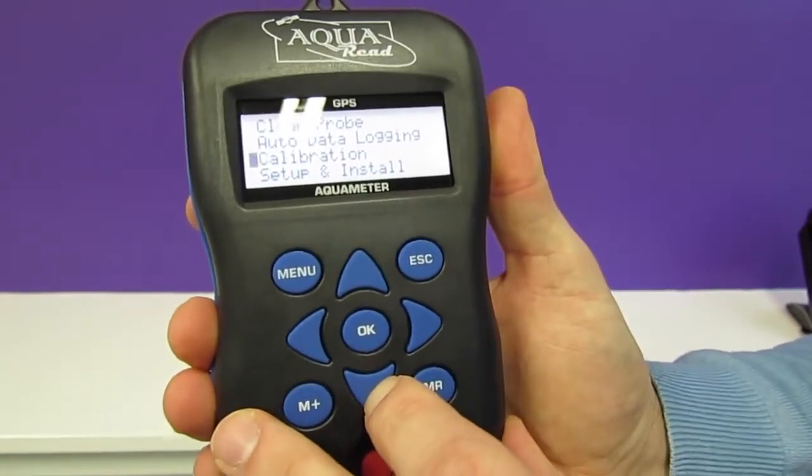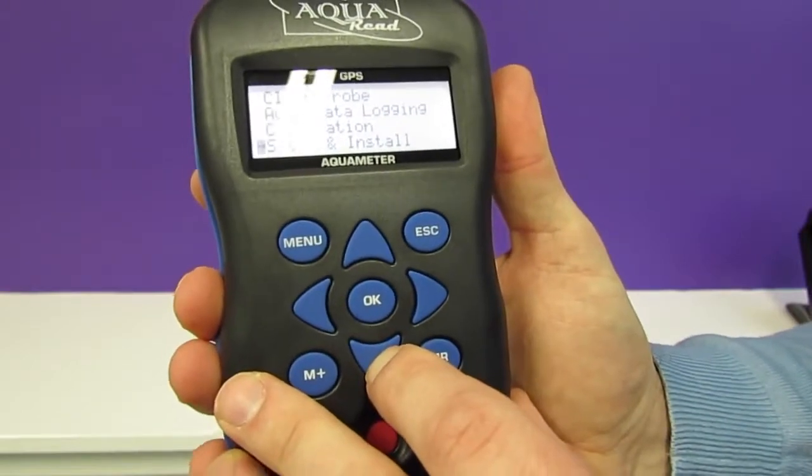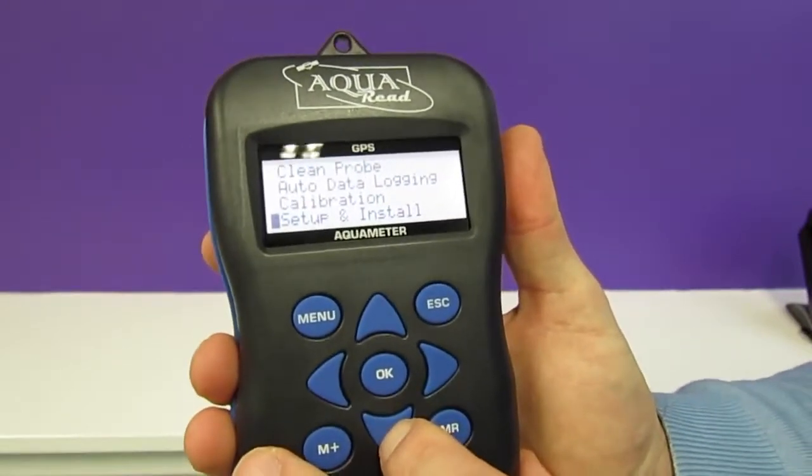It allows you to calibrate the meter and the probe, and to set up and install sockets depending on which AquaProbe you're currently using.